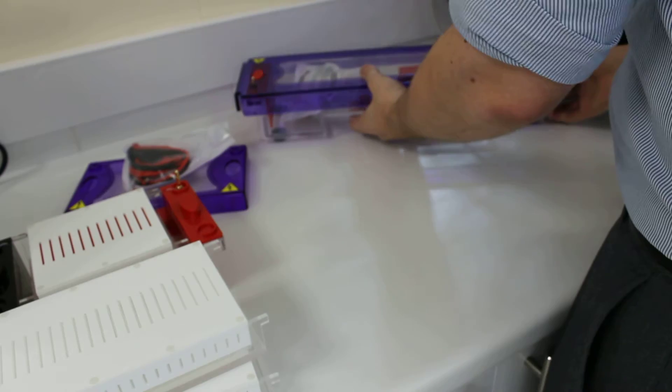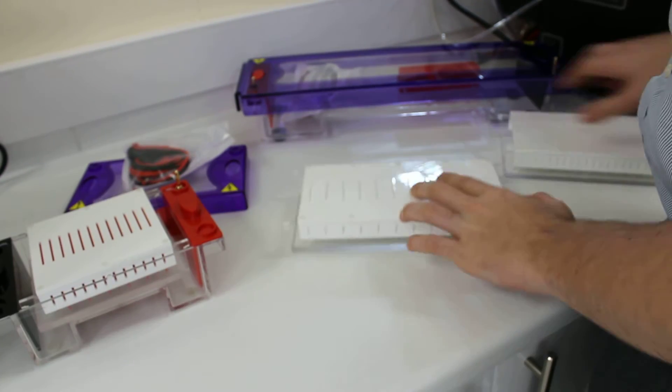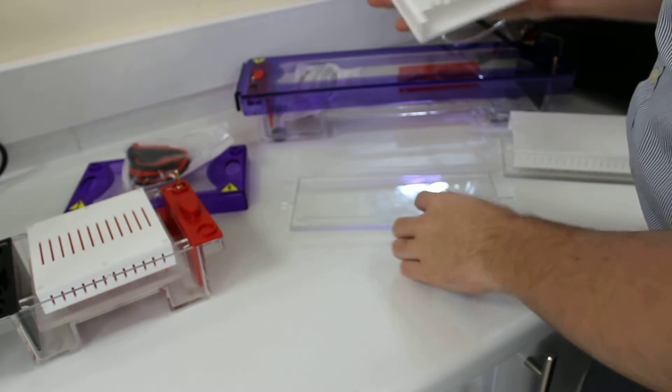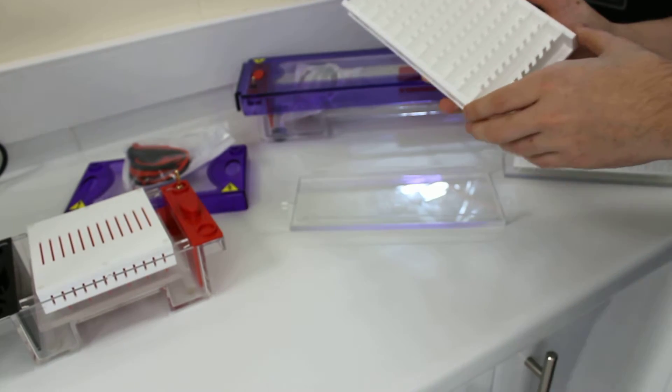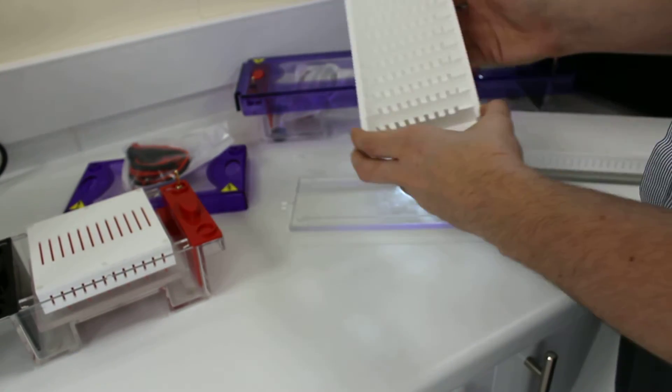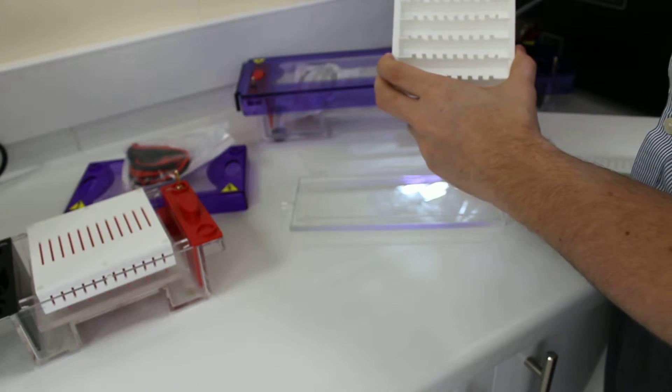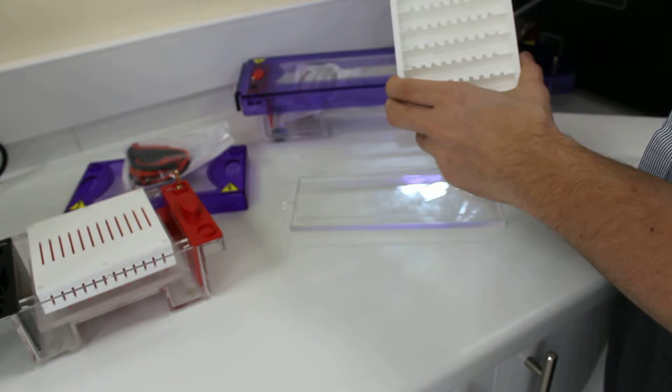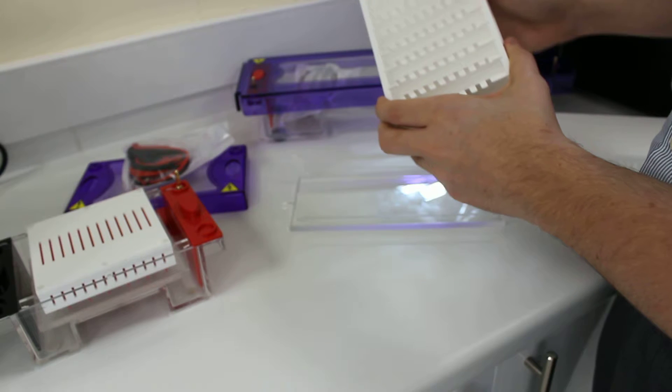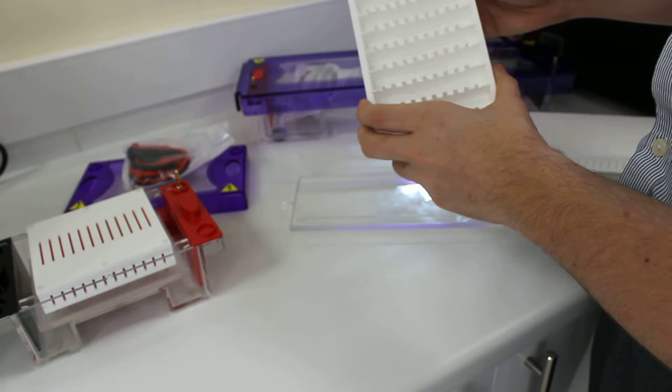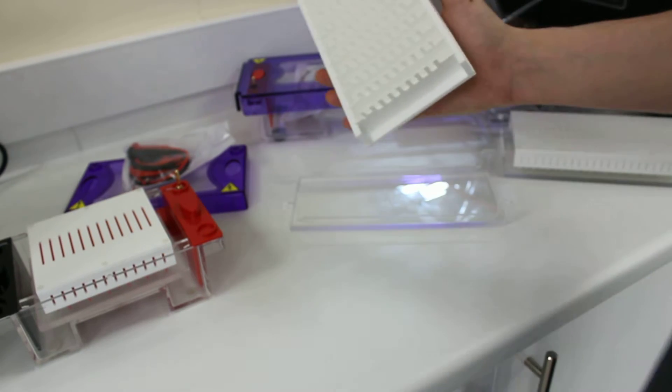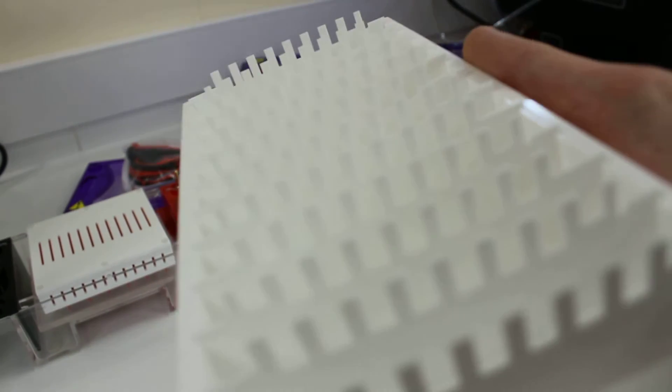So you can get two different arrangements of combs with this tank. You can either have the 96ST, which is essentially the same as the MS-MIDI-96, where you have the combs running through the combs in front of them. But because the tray is longer, you get double the run length of 3.6cm. I'm going to do a quick zoom in so you can see how they are arranged.